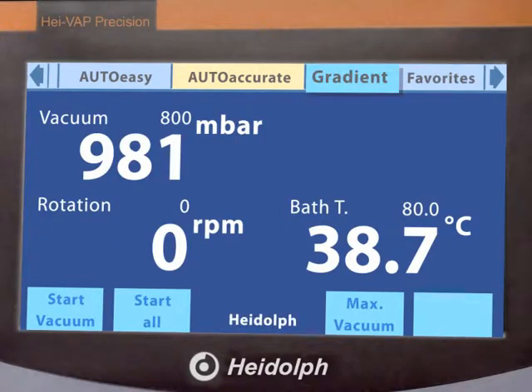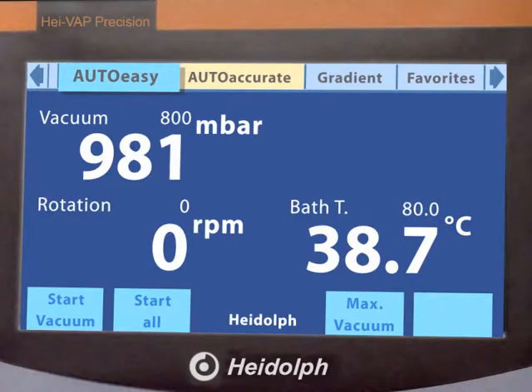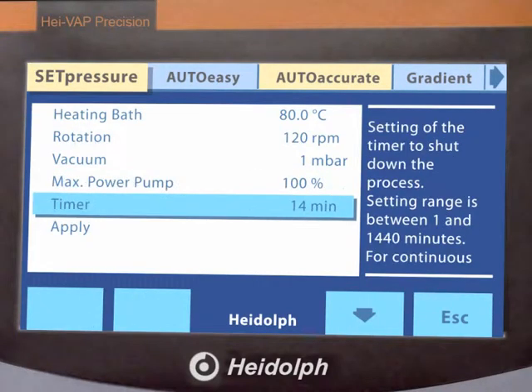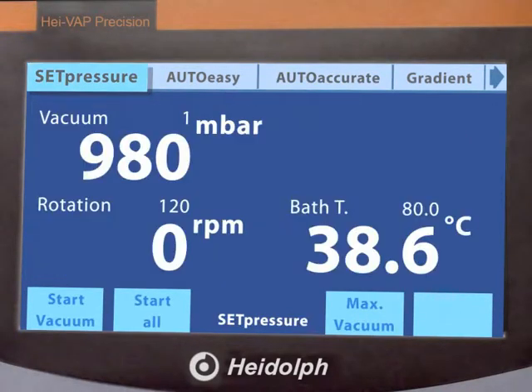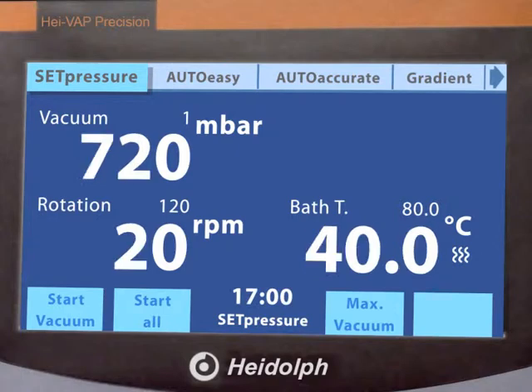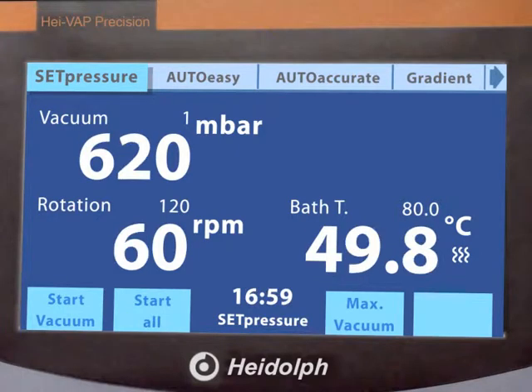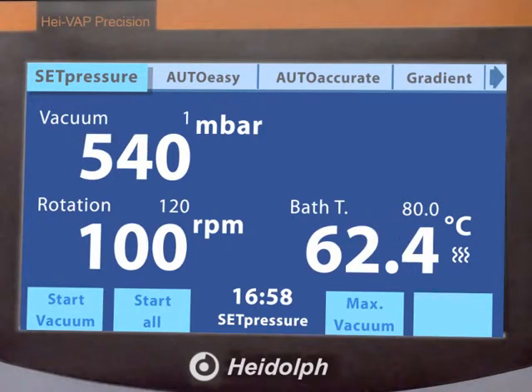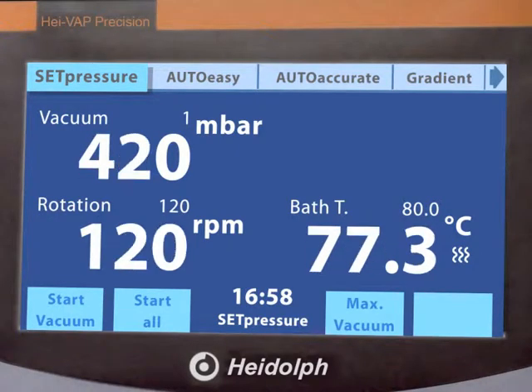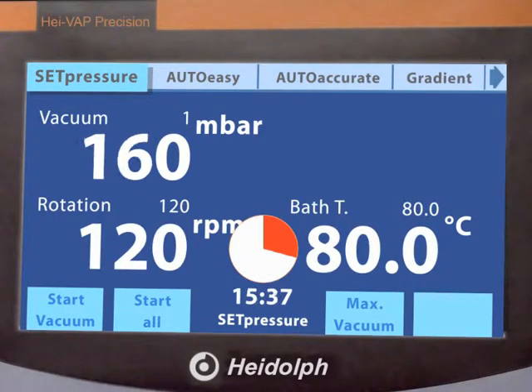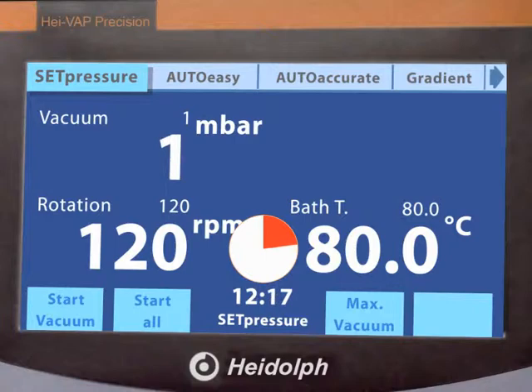Experience the advantages of the automatic process timer, which turns off your evaporator at a pre-programmed time and raises the flask, stops rotation, shuts heat bath power off, and releases vacuum.